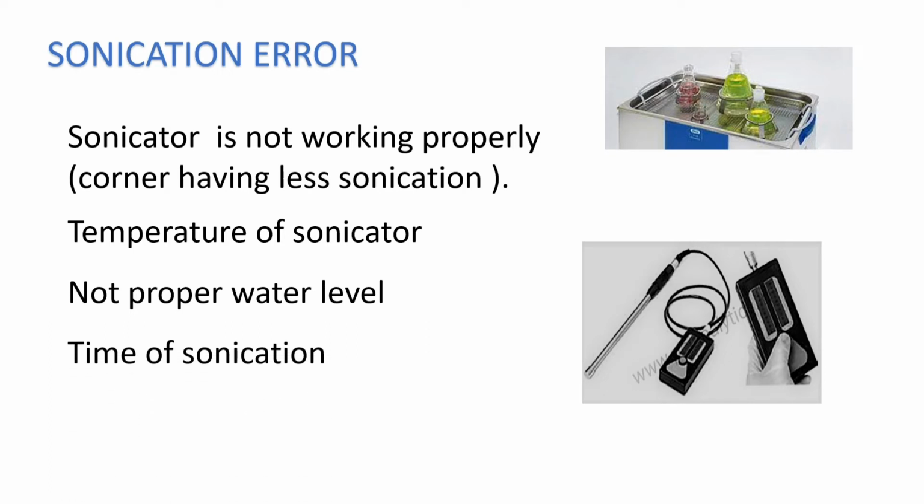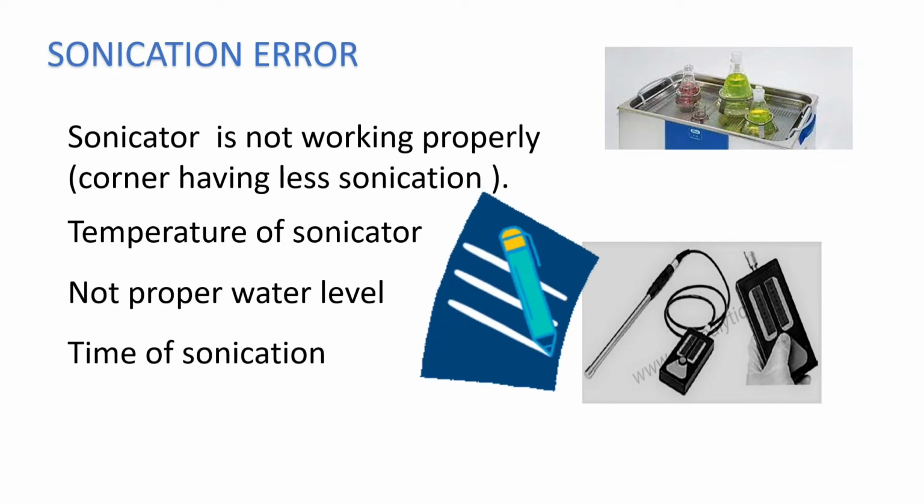Then time of sonication. How to identify time of sonication in the worksheet, in the test data sheet? When you are keeping your volumetric flask and solution in the sonicator, you can write the start time and you can write the end time. If 10 minutes is mentioned, what is your start time of the sonication of your flask and what is the end time?